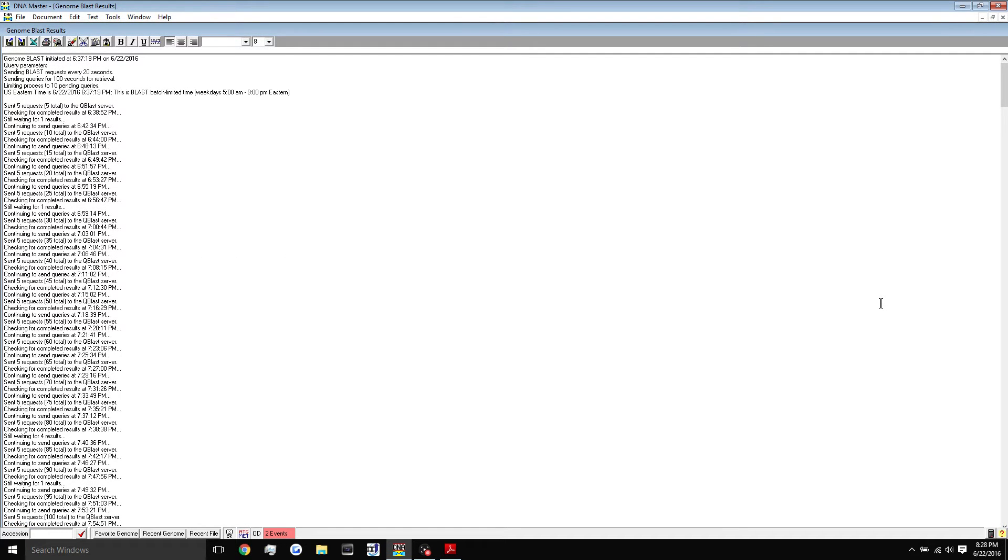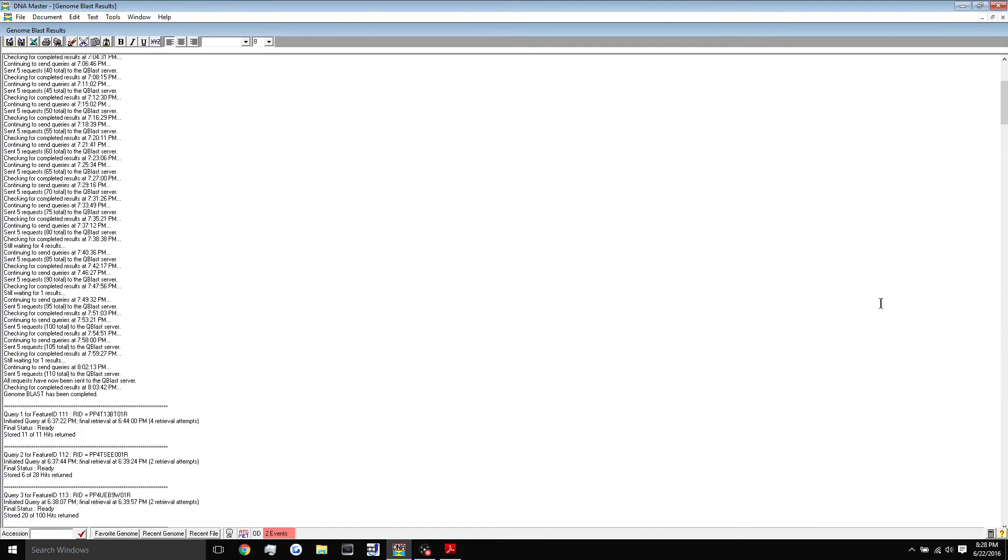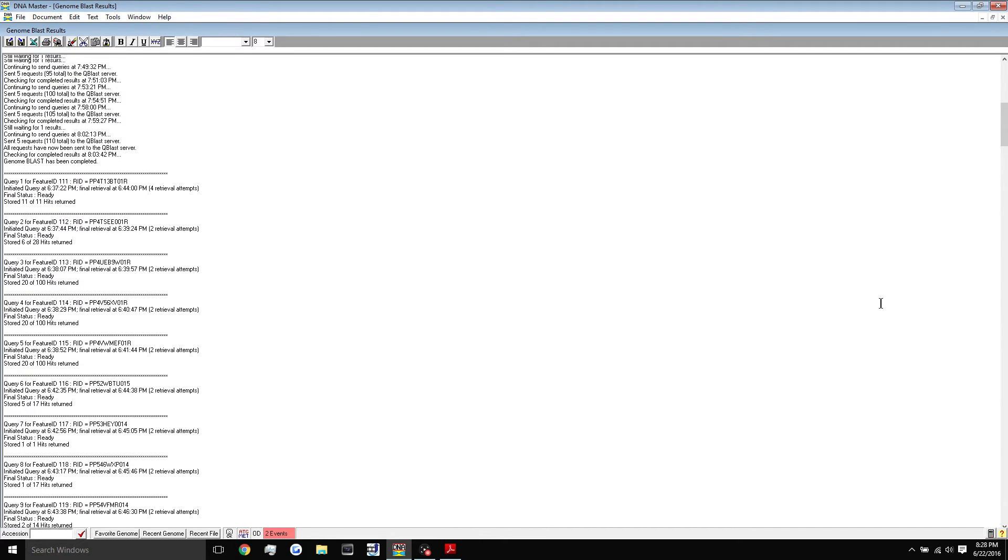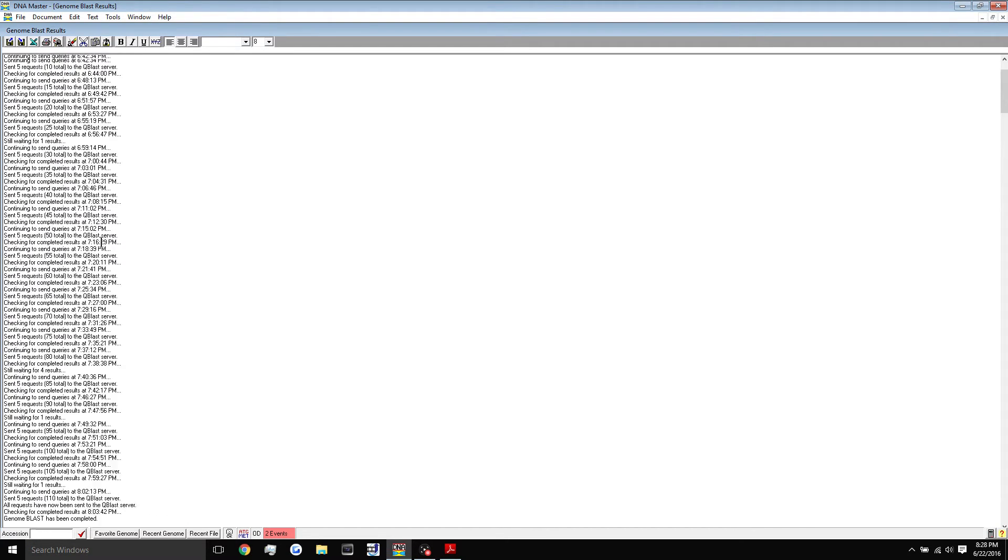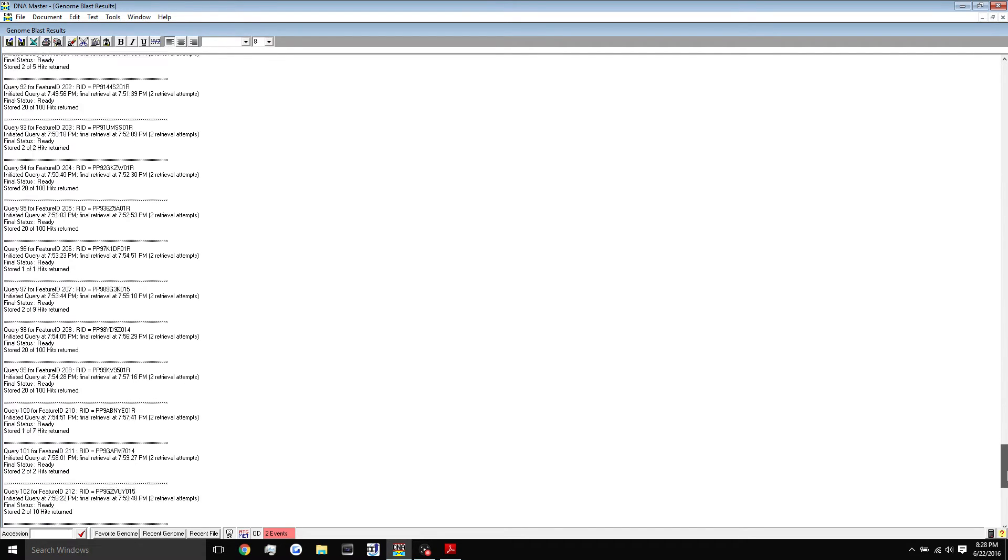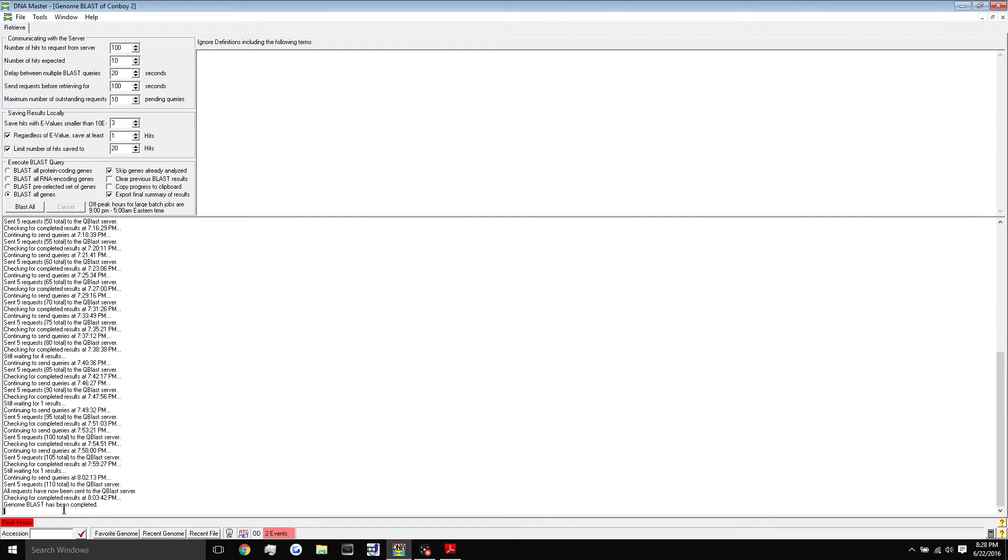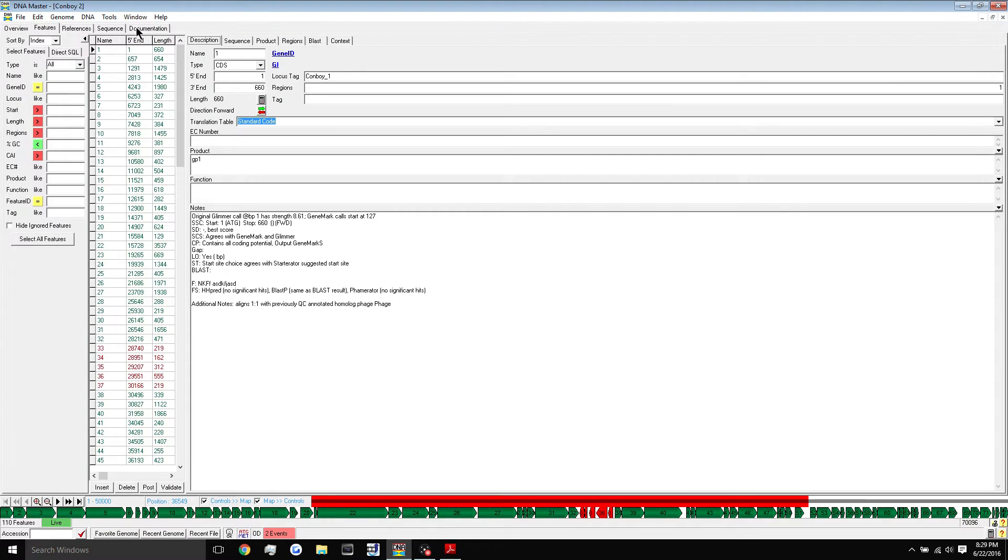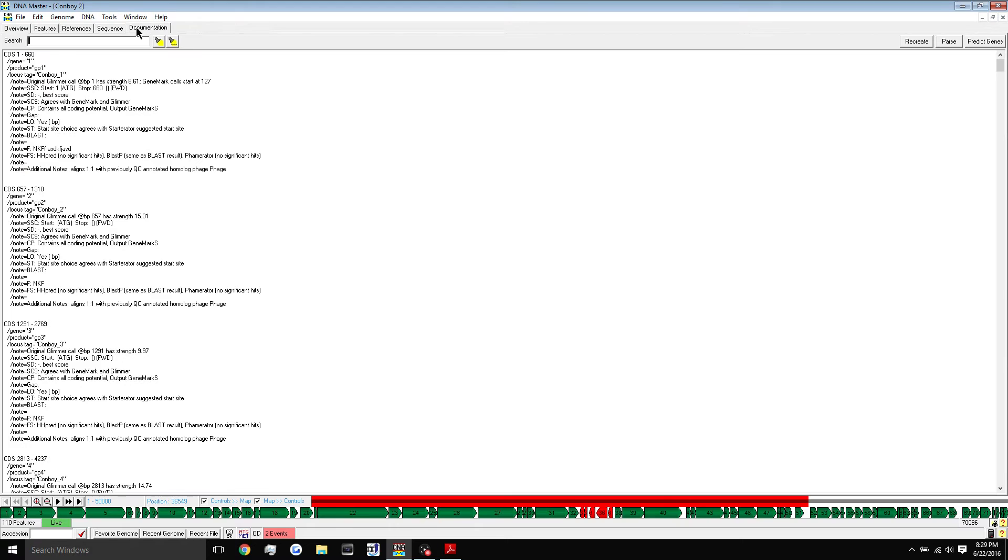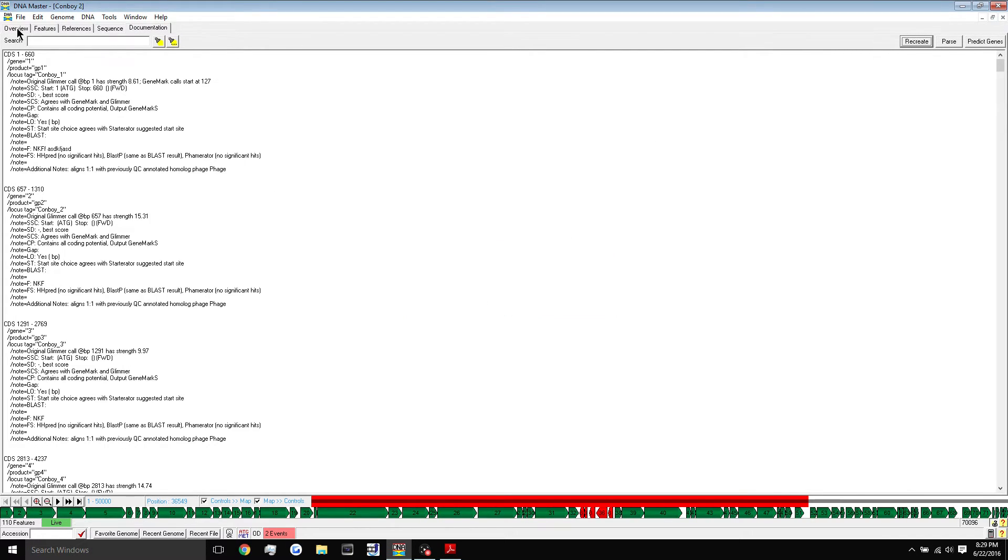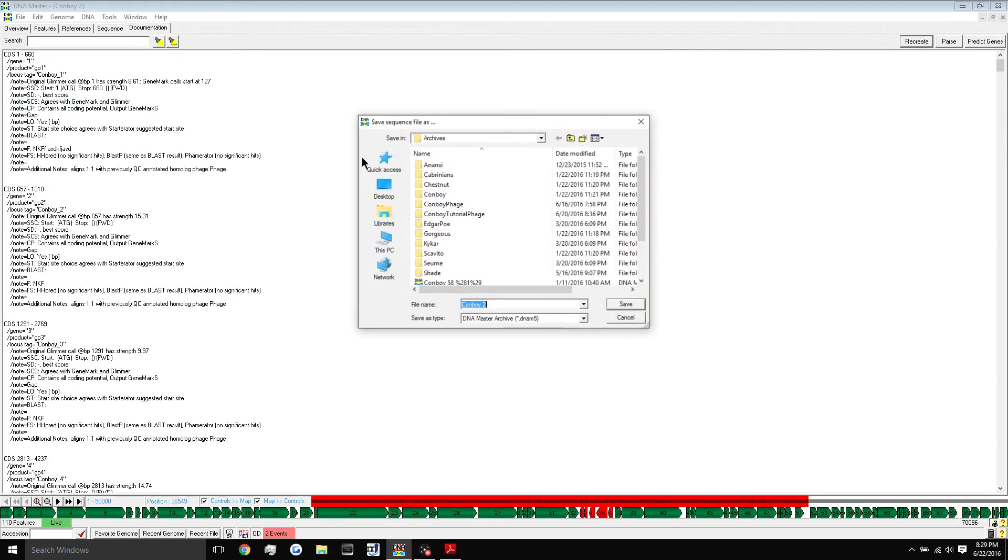All right guys, the blast finally finished up and here is the log that it exported. You can see what the program was doing at certain times. Once it's finished, you can just simply exit out of this log and you'll see here genome blast has completed. That's what we want. The first thing we want to do is to save the file definitely. We're going to go to the documentation, recreate the documentation, and then we'll go up to file, save.